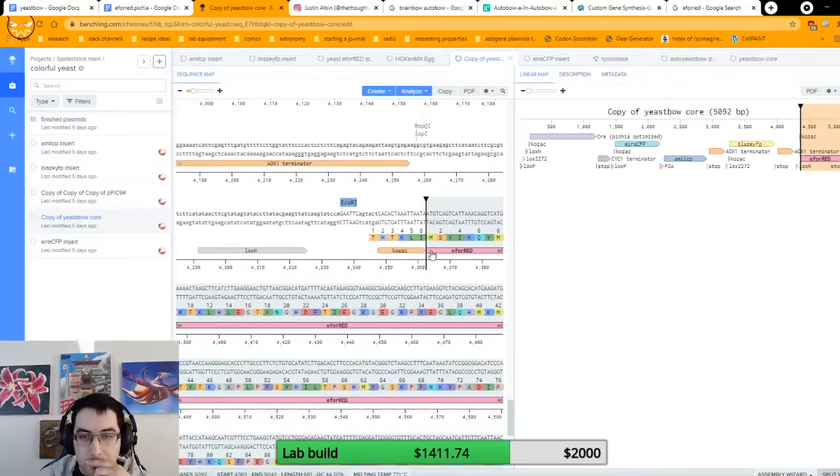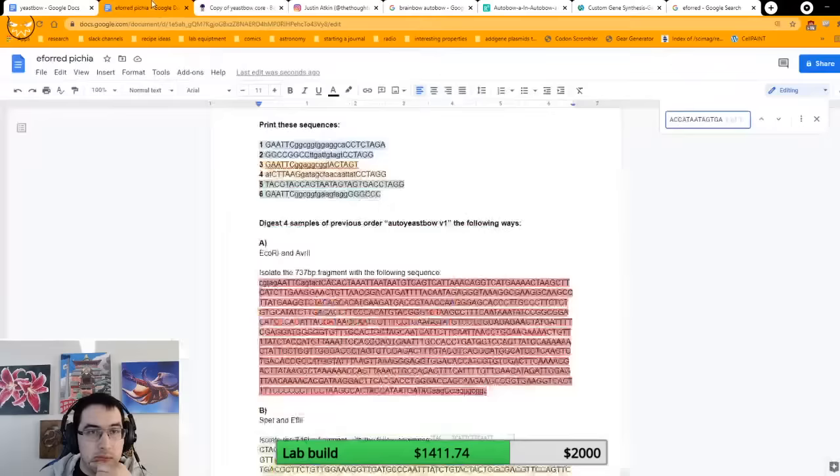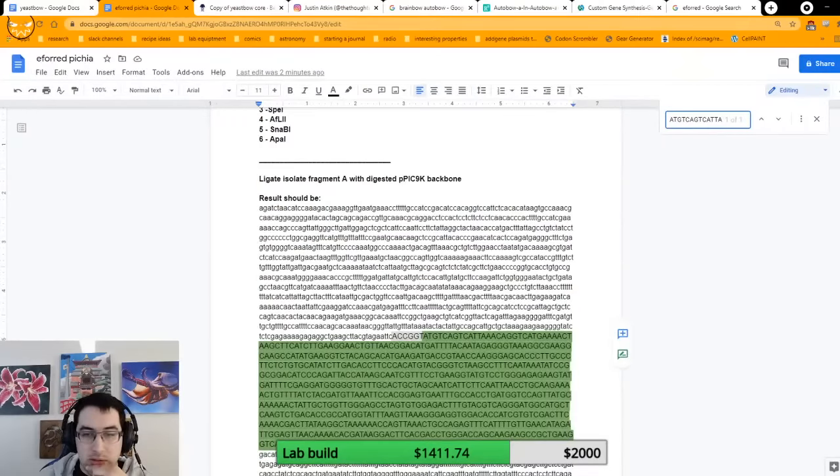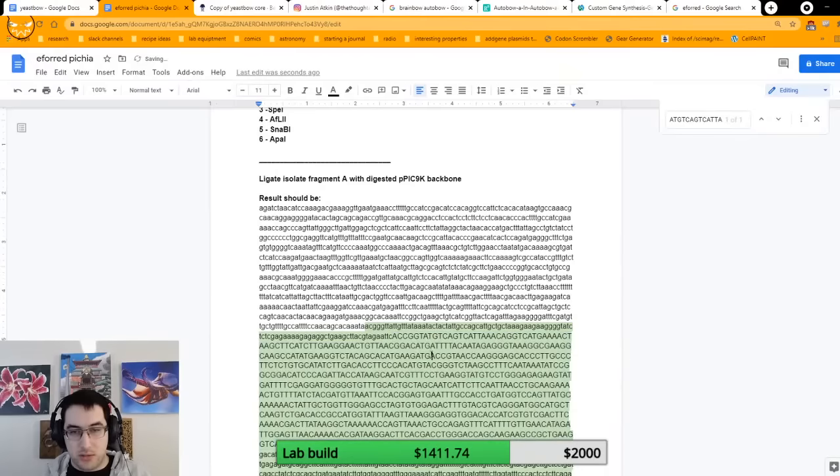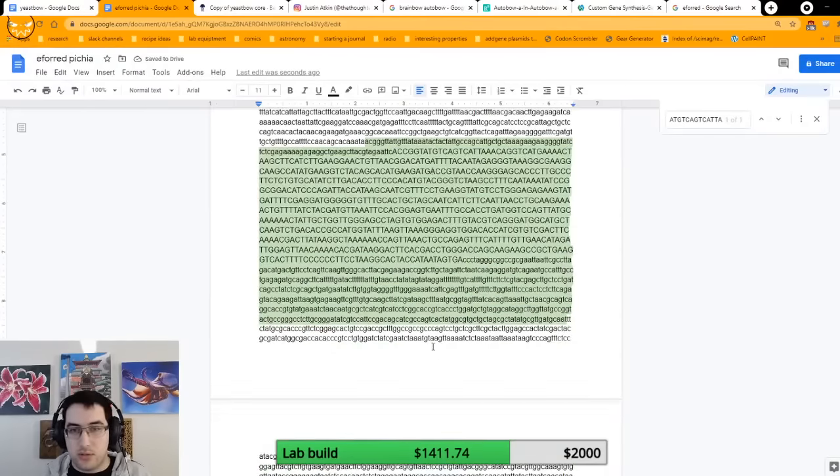Okay. Okay. I see all of this stuff. ATG. ATG TCA, right? ATG TCA. That's correct. This is correct. Which means there's a bunch of extra schmo. Oh god, no, go back, undo, undo. Very undo.